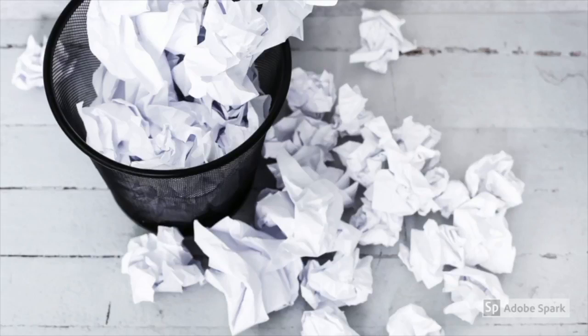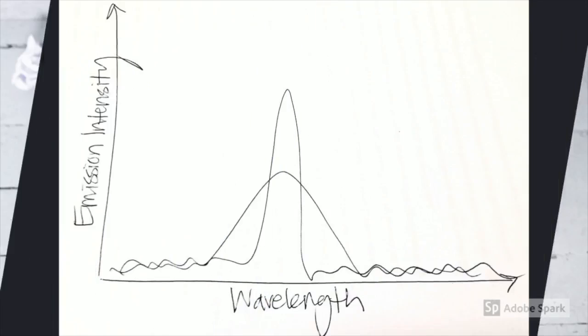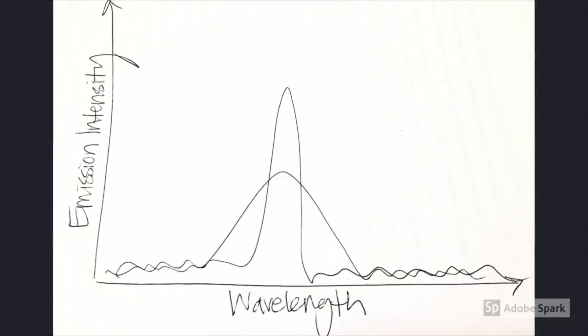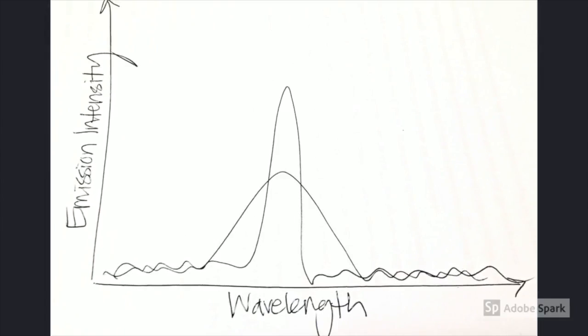These are the photons that were emitted at similar wavelengths, but not the maximum wavelength of emission, so their intensity is not as high. Depending on the energy put in, the base of the peak can be wider or narrower, just like how if you throw with less energy, the paper will land farther from the basket.